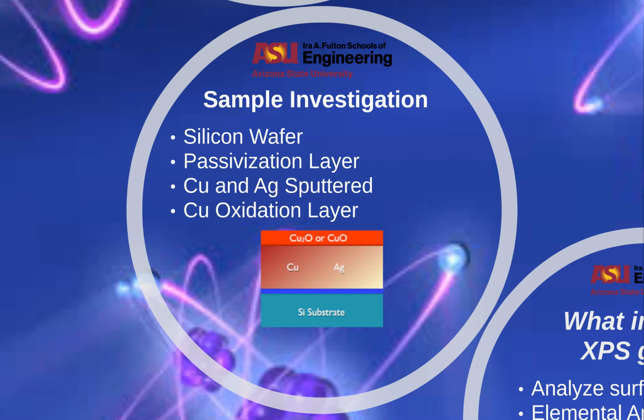Sample investigation for our experiment. A 100 silicon wafer was deposited with a passivation layer using MOCVD and then sputtered with copper and silver metal. We wanted to determine the oxidation number of copper on the surface of our samples for different annealing temperatures.